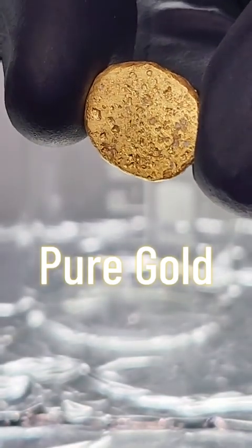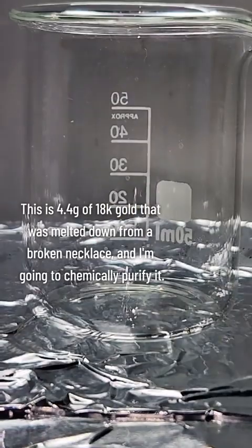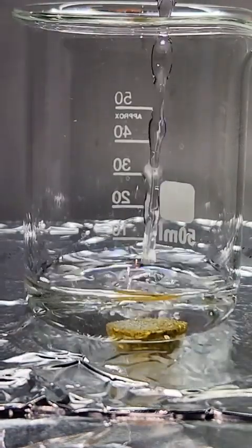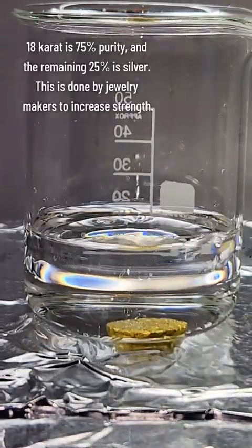I got this piece of 18 karat gold from an old broken necklace that was melted down, and today I'm going to show you how to refine this into 24 karat 100% gold. 18 karat gold is a 3 to 1 alloy of gold and silver, and this is done by jewelry makers to increase durability.